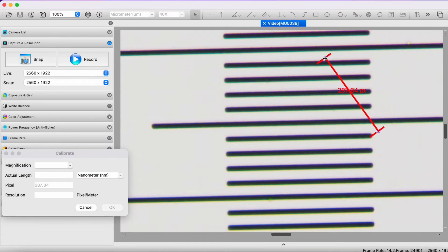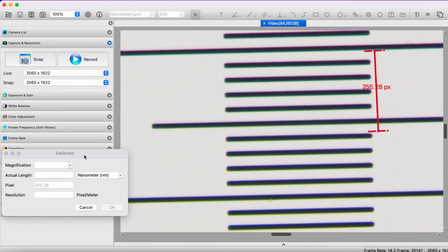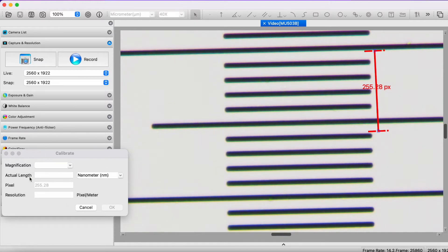The reason I suggest setting the calibration software to 100% before opening it is that if you're not at 100%, the computer will tell you. And then when you go to set it to 100%, this line may fall outside of the screen. Setting the digital zoom to 100% first ensures the line is on the screen and you're able to access both ends.